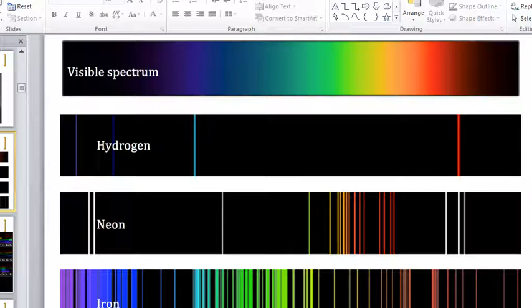If you look down here at iron, for example, I see multiple wavelengths that are there. There's tons of them. One of those is going to be the best, and that's typically where I would make my measurements. But there's going to be a handful of others that are present. I see all of them. They're right here. All of these, iron will absorb. But not all of them are going to be important. And sometimes I can't pick the best one. I have to settle for second best or third best.